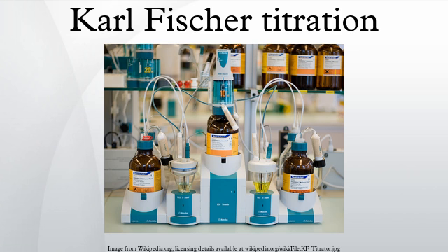The major disadvantage is that the water has to be accessible and easily brought into methanol solution. Many common substances, especially foods such as chocolate, release water slowly and with difficulty, and require additional efforts to reliably bring the total water content into contact with the Karl Fischer reagents.